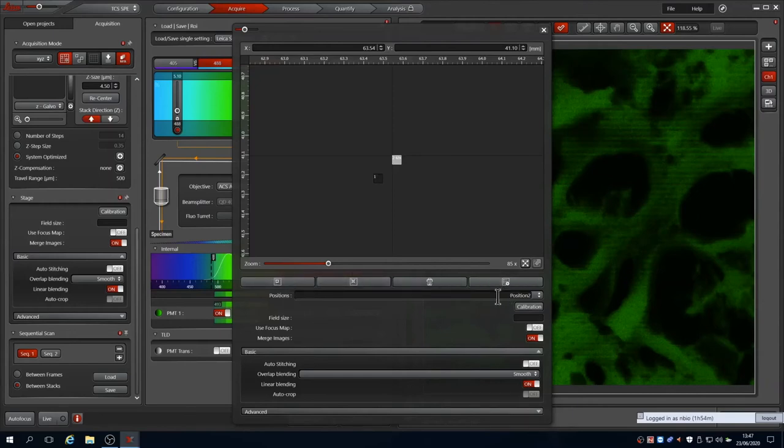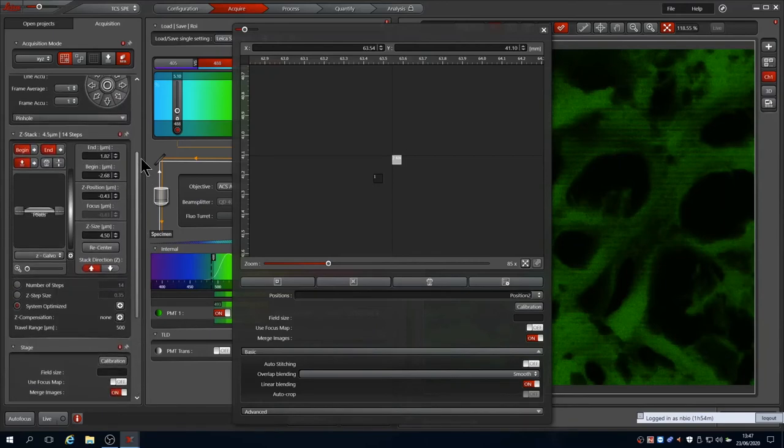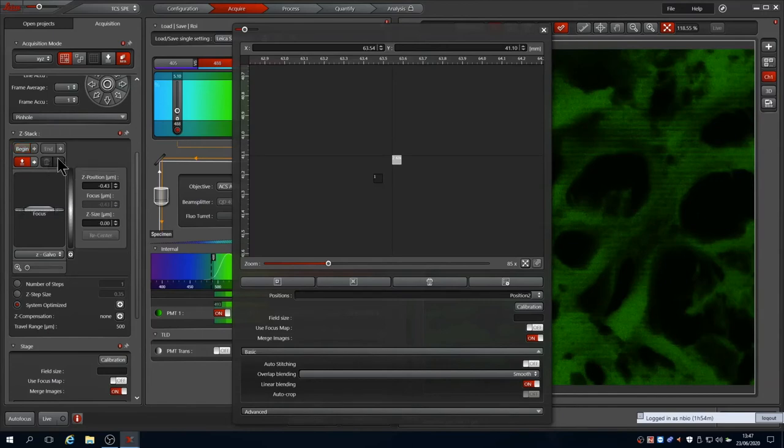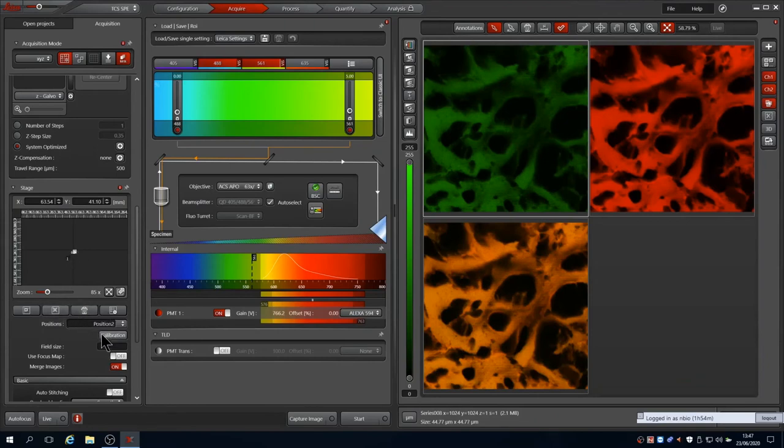It is better to do this while scanning in live to find the fields or use the oculus. To make this tutorial faster, I'll switch off the Z-Stack by deleting the begin and end positions. For each position, we can then set a field size by typing in the area you wish. Here we define it as 2x2 fields. Other options are available.